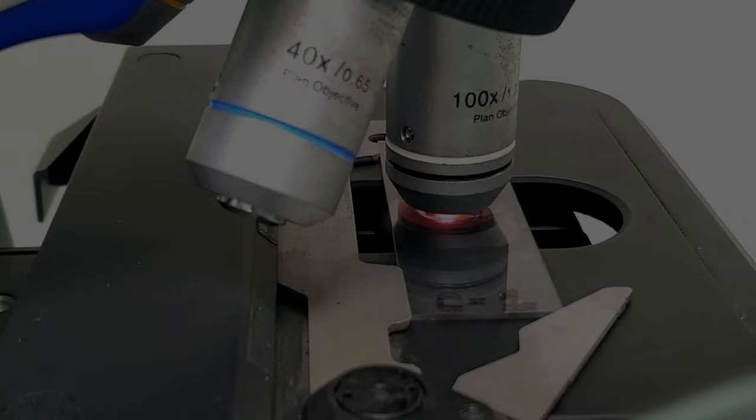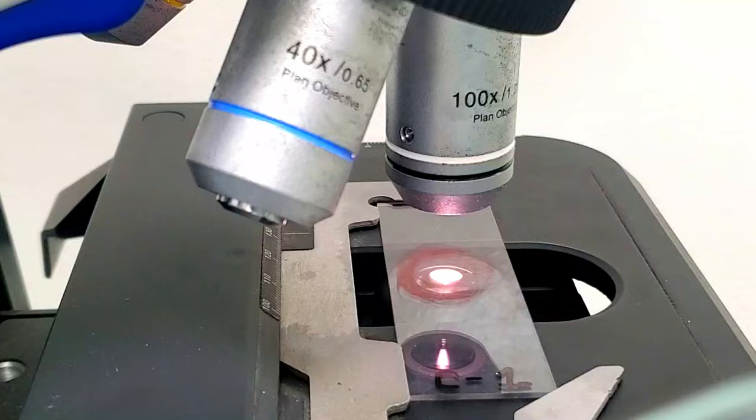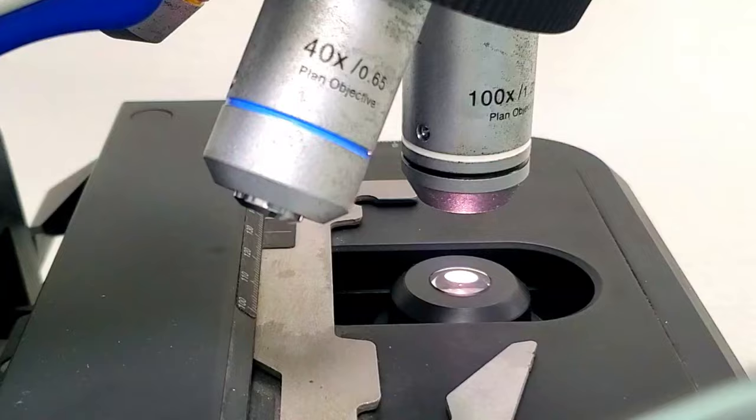After the result observation, remove the slide from the microscope and discard it appropriately. Clean the microscope lens to remove adhered sticky oil properly using a soft tissue paper. Use appropriate solvent with the tissue paper for better cleaning if necessary.